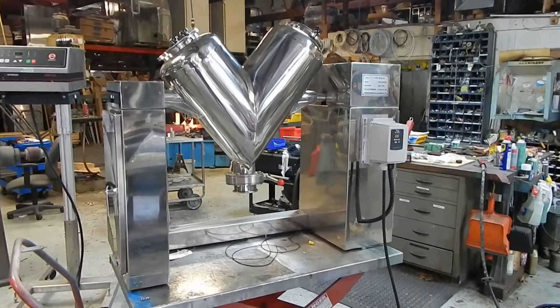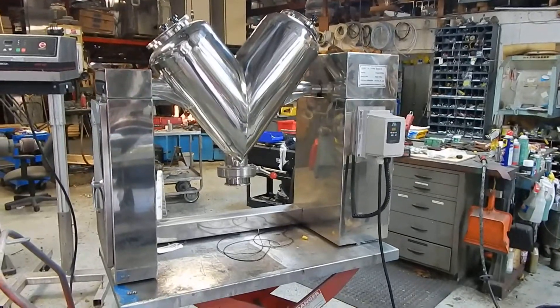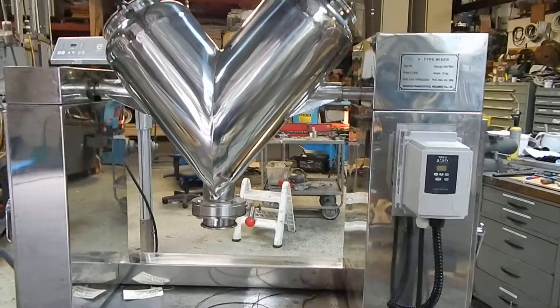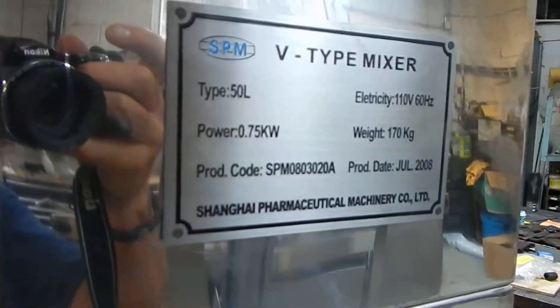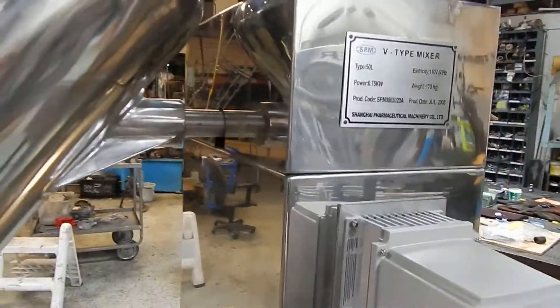Hi everybody and welcome again to Champion Trading Premier Manager for you today. This is a two cubic foot twin shell blender made by Shanghai Pharmaceutical Machinery Company Limited. It's one of China's premier manufacturers — they even appear on the New York Stock Exchange. They list it as 50 liter working capacity, or two cubic foot.